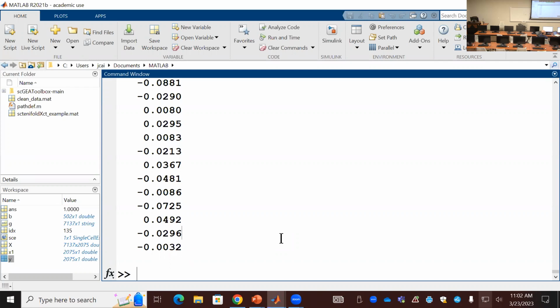500, that's a lot. But okay. If you can give me the 500 gene names, I can build that in here. Let's see the separate cell types. It doesn't matter. We can do this predefined cell score, or you can define your own score here.